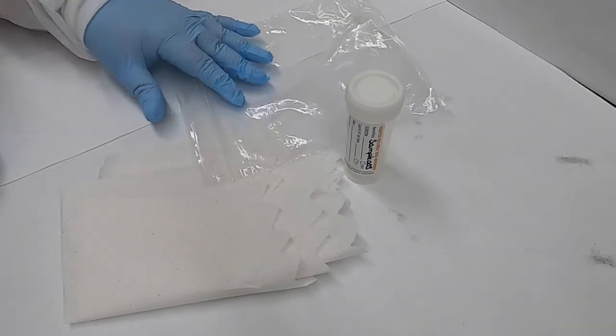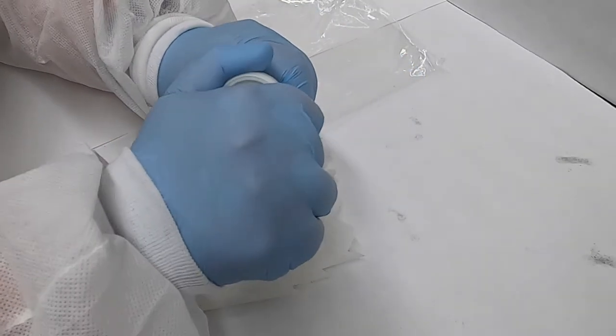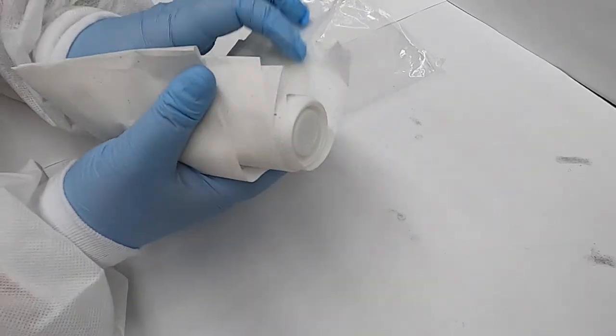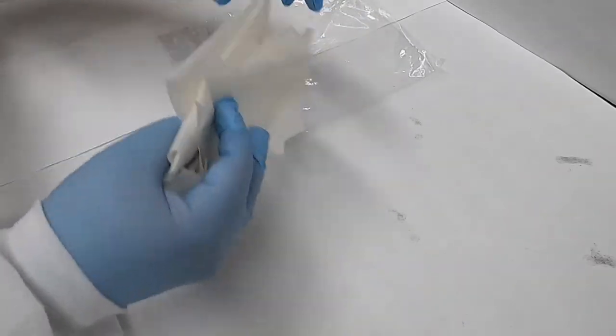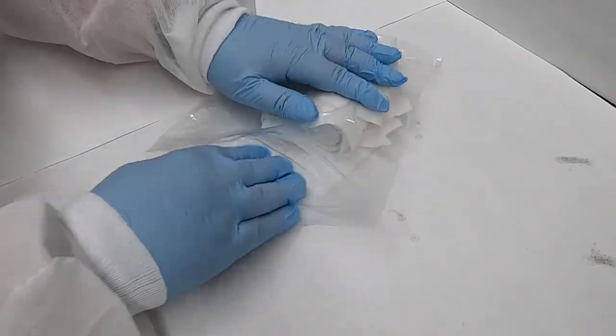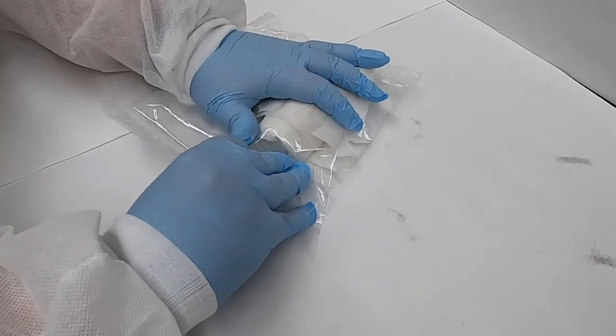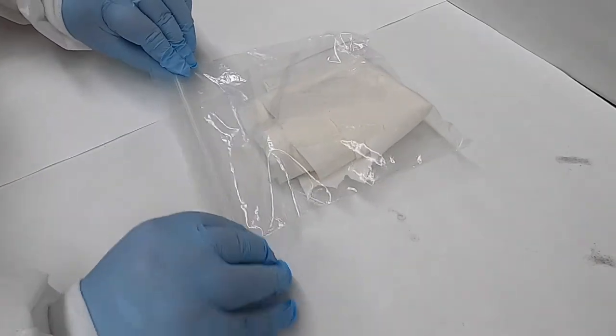So in this case, we have a plastic tube with perhaps a fecal sample in it. We ensure that it's sealed completely, wrap it in our water absorbent material that's sufficient to absorb any liquids that may be present in that sample, and then seal it in the watertight Ziploc bag, being careful to remove all of the air.